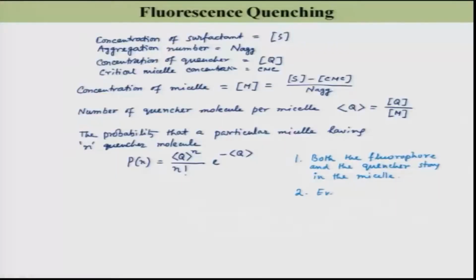Clear? Okay. So, even a single quencher will deactivate all the fluorophores in the micelle.